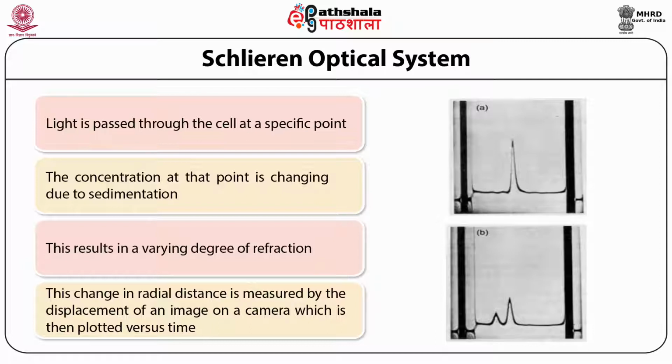At the initial stage it has only one peak, but once the centrifugation process starts, it starts moving, and the appearance of another peak indicates the separation of molecules during the course of time.